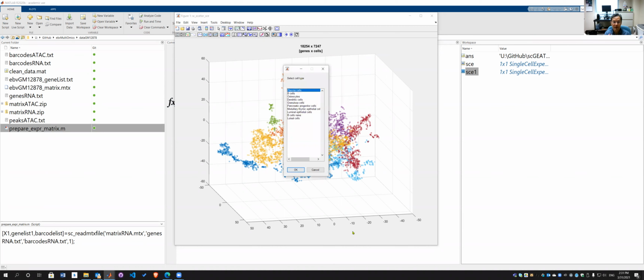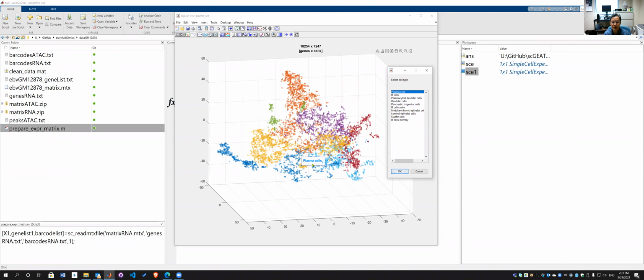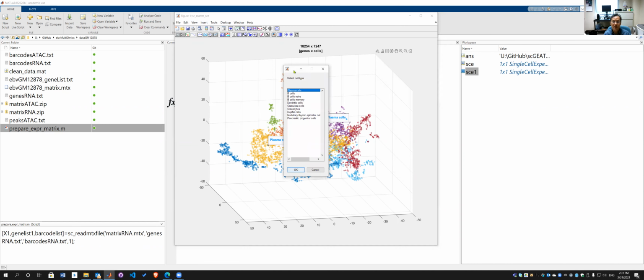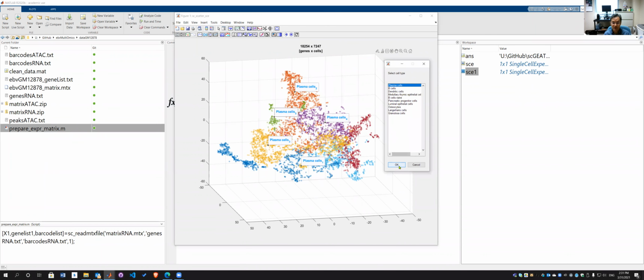Okay, the program will run and found the first cluster. So this annotation for the cluster number 1: plasma cells. So if I say yes, that's my annotation for cluster number 1. And then second, plasma cells. Third, plasma cells. Plasma cells are B cells, which actively produce antibody. So I know the cell type is lymphoblastoid cell line of my sample.